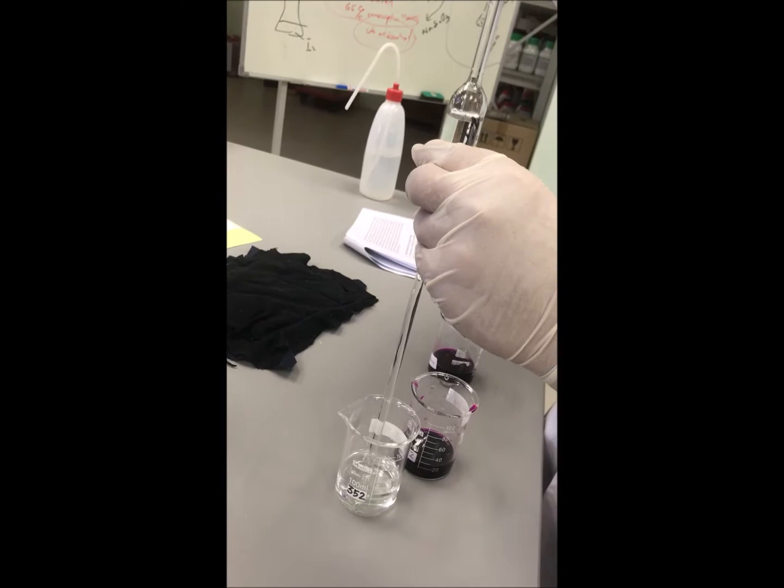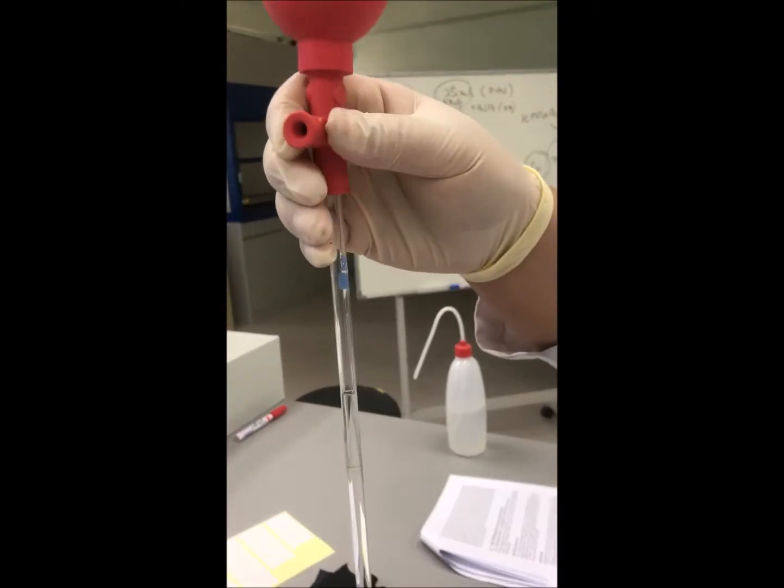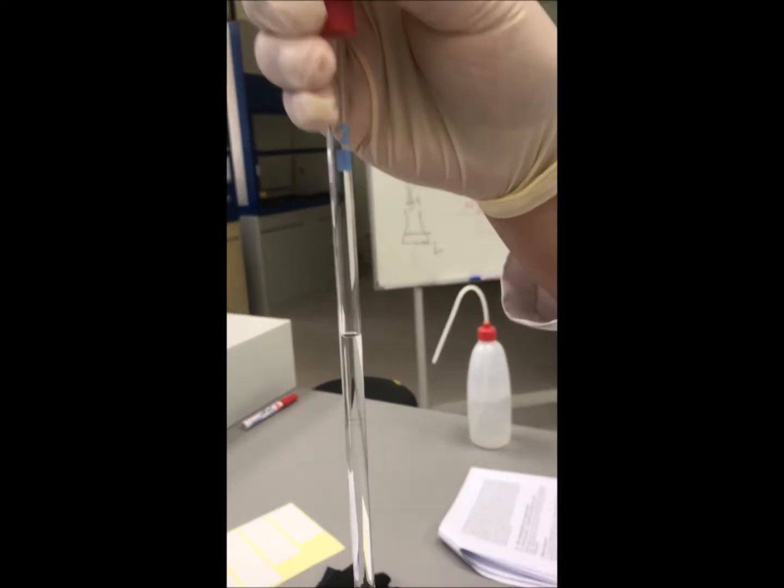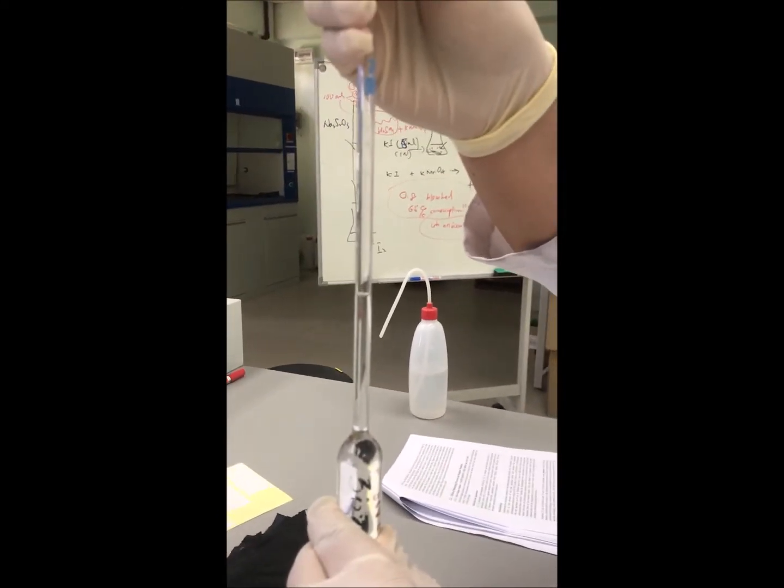Make sure the position of the pipette is straight. Then, suck the solution over the marker and release it until the bottom of the meniscus is touching the marker.